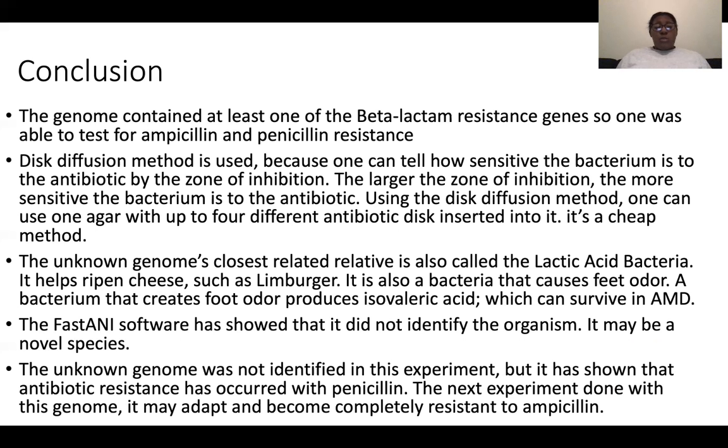The unknown genome was not identified in this experiment, but it has shown that antibiotic resistance has occurred with penicillin. In the next experiment done with this genome, it may adapt and become completely resistant to ampicillin because the zone of inhibition was not that big.